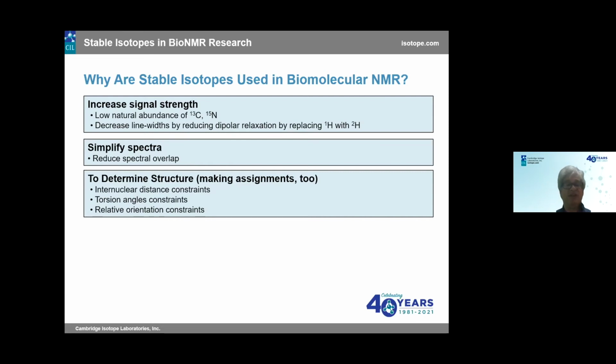And these are gained by various types of NMR experiments. NMR experiments that may look at the internuclear distances between two or more atoms. This can be done using the nuclear Overhauser effect or NOESY-based experiments. One can also use scalar-based experiments, that is triple label experiments, to look at connectivities, say in the backbone, to walk down the backbone and to look at the various R groups of the amino acids.